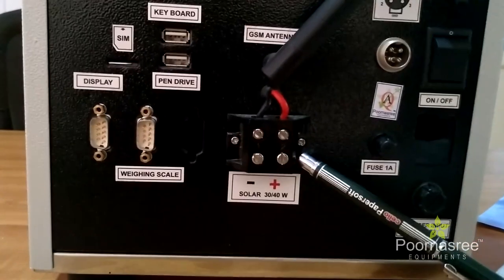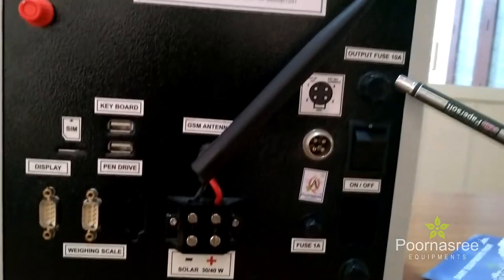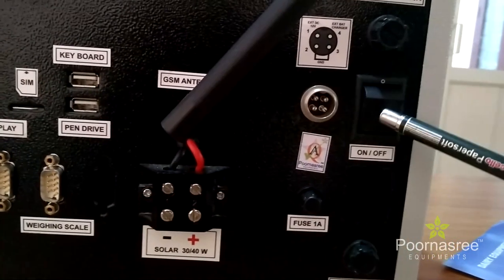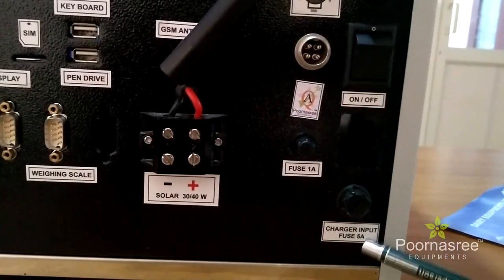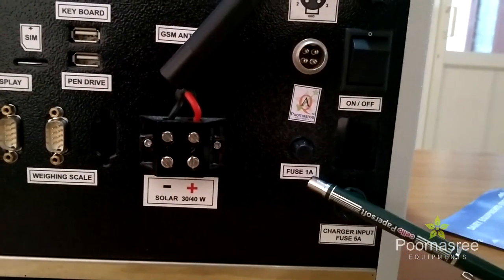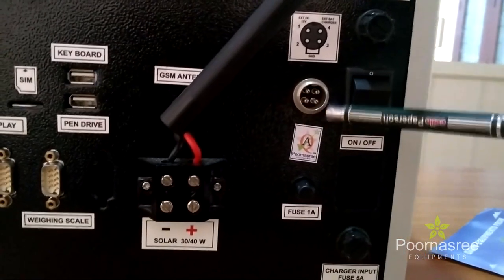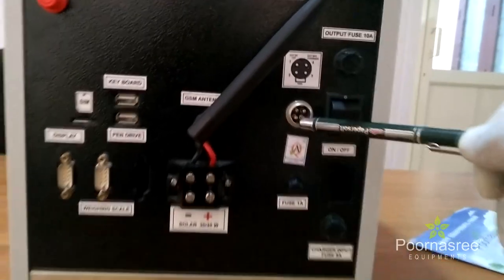And this is the solar power connection. This is the output fuse, 10 amps. This is the power on/off switch. This is a fuse, 5 amps. And this is a fuse, 1 amp. And finally, this one is the power input, so that we can use either solar or electricity.